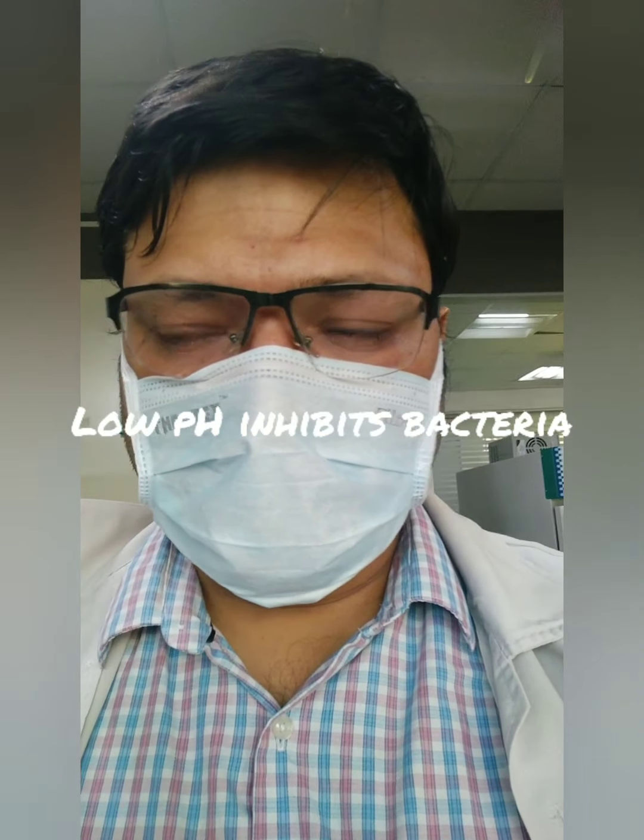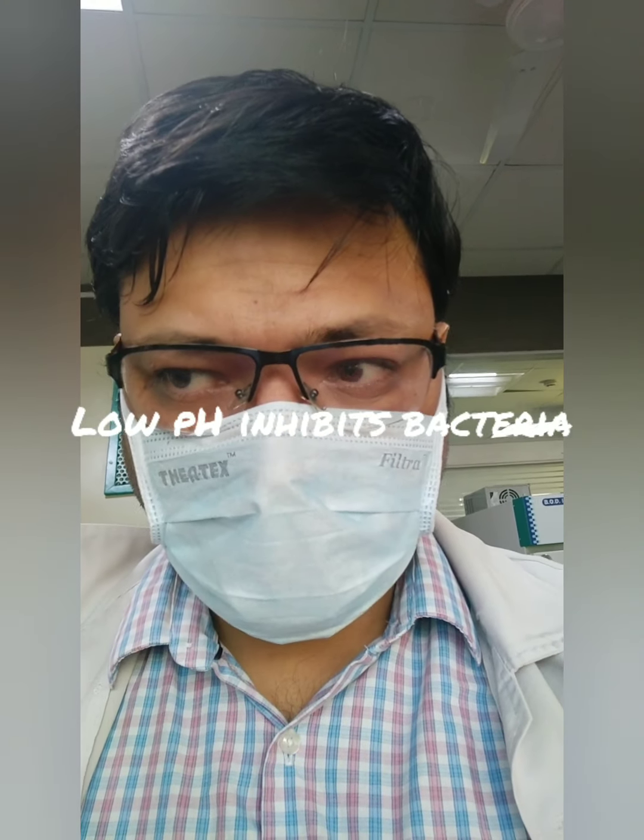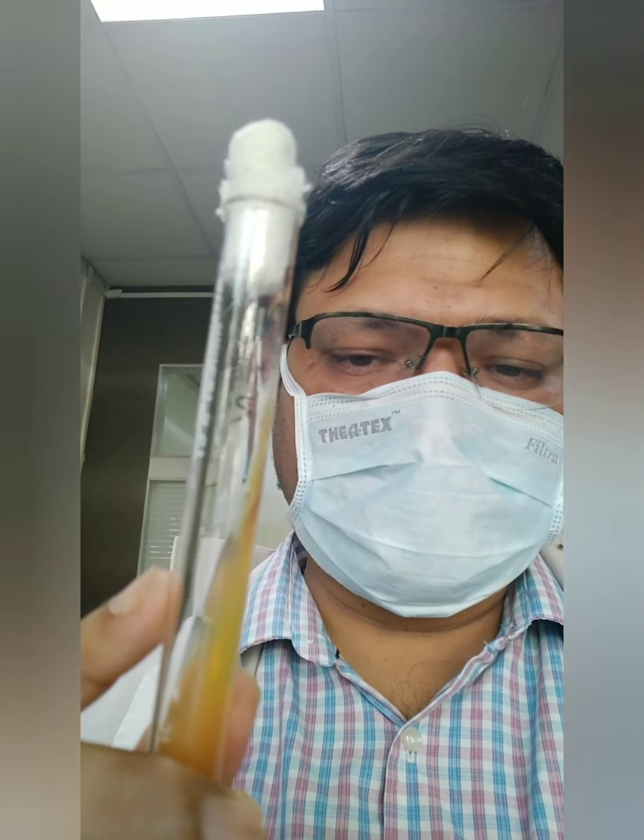Lowering of pH and addition of extra dextrose makes this media selective for fungus. At a lower pH it does not allow bacteria to grow, and higher concentration of sugars is also inhibitory for bacterial growth. It is used for cultivation of fungus when suspecting a person is suffering from a fungal disease like dermatophytosis or any type of mycoses.